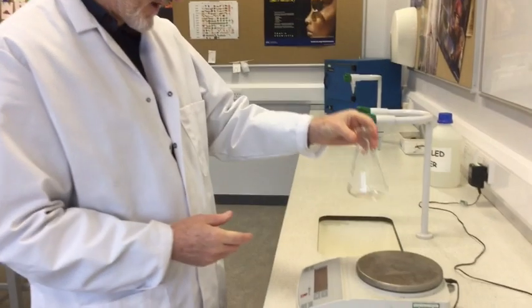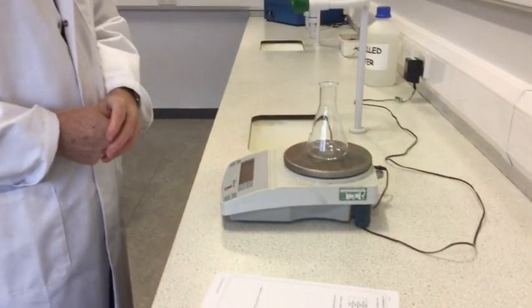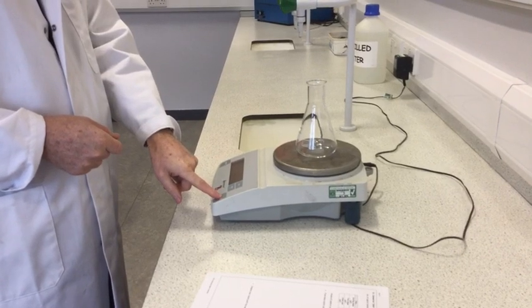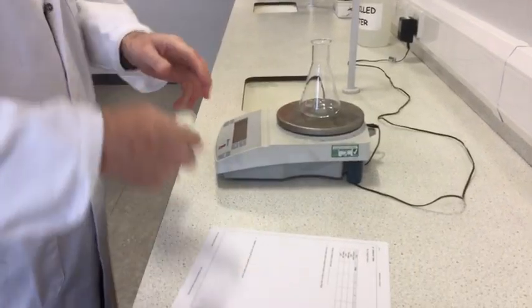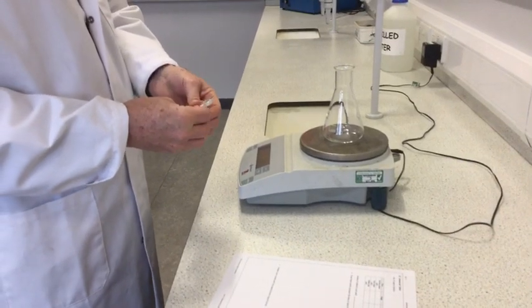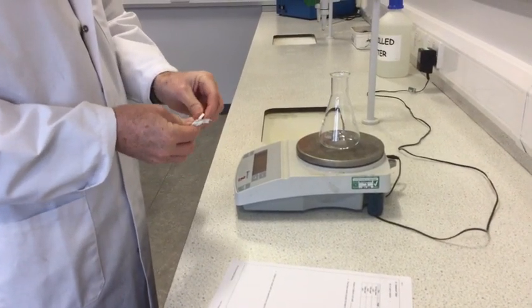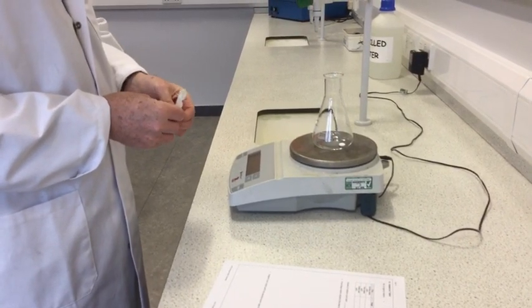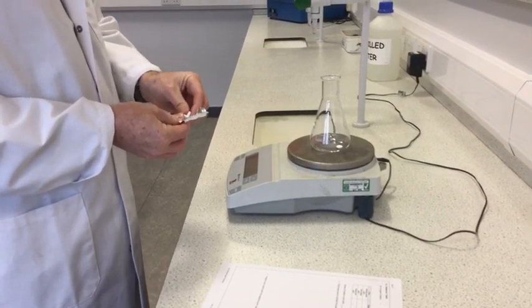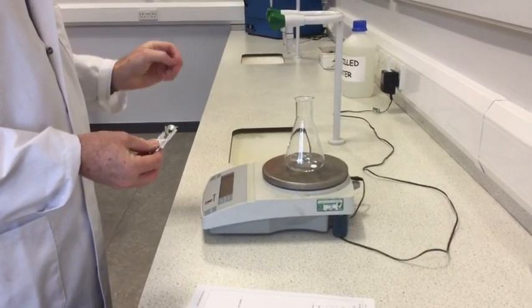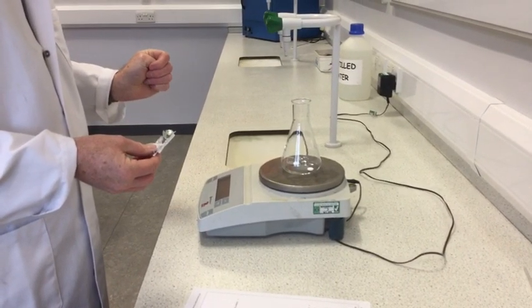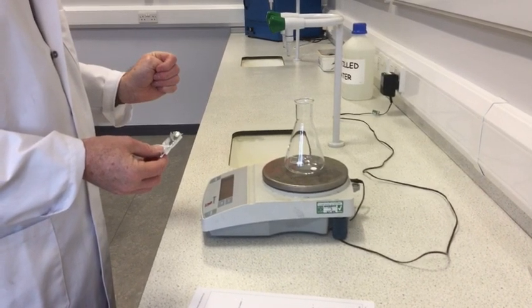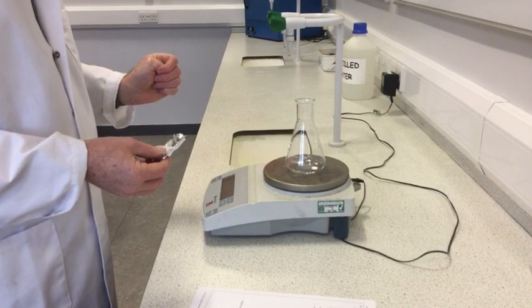So, I get a large conical flask, put it on the balance and tare it. Now, I want to add some aspirin tablets, so I have approximately 1.5 grams. So, one tablet is about 0.6. Two tablets, settling at 1.21 grams.